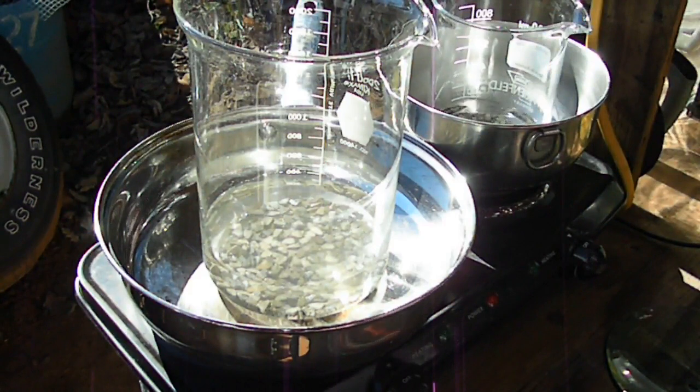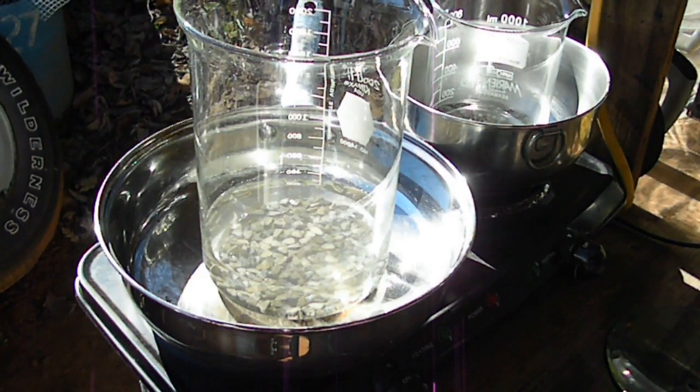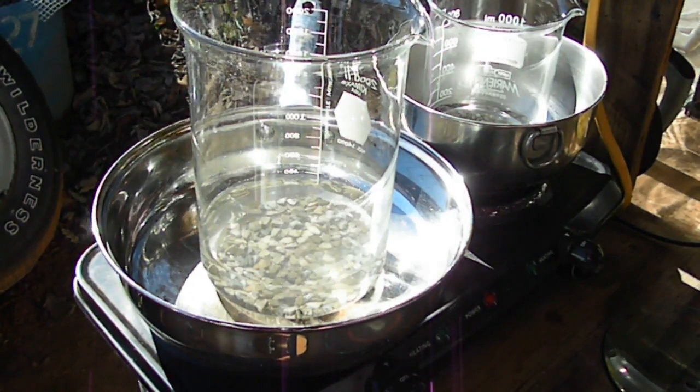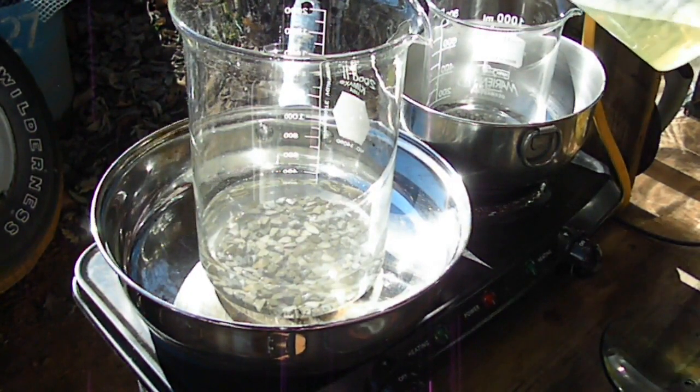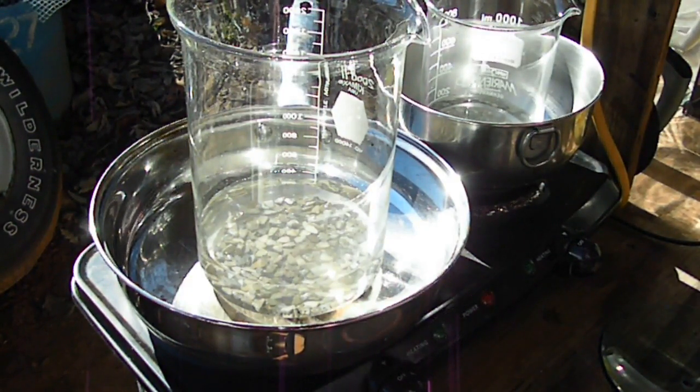So let me go ahead and get this ready. Let me flip the back fan on because we are definitely going to generate some NOx. So let me go do that right quick. And then we are going to go ahead and start adding our acid. Start the little one up first. And I'm going to put about that much. I'm getting an instant reaction.